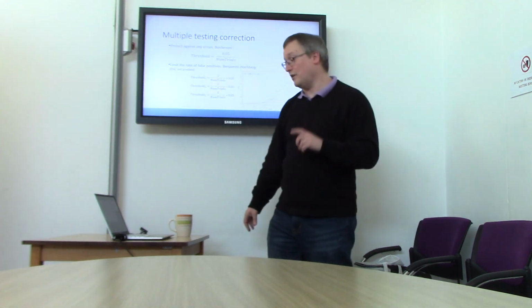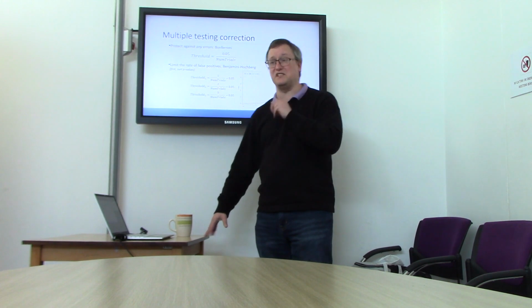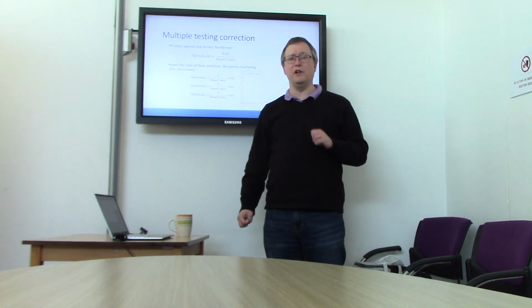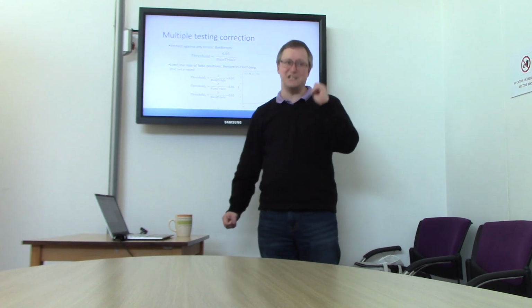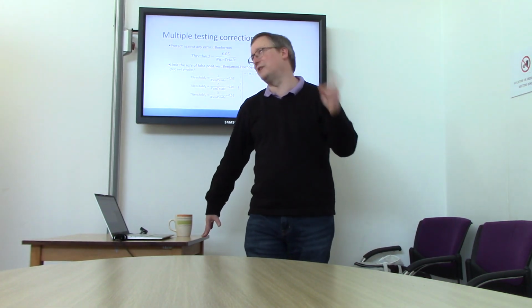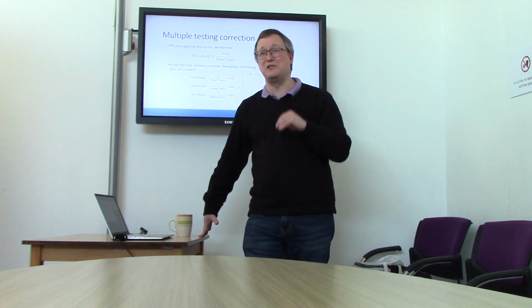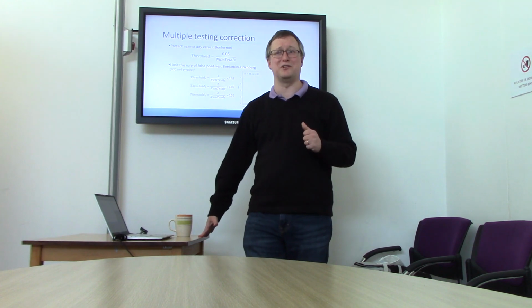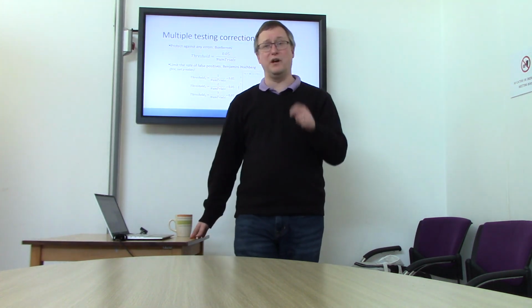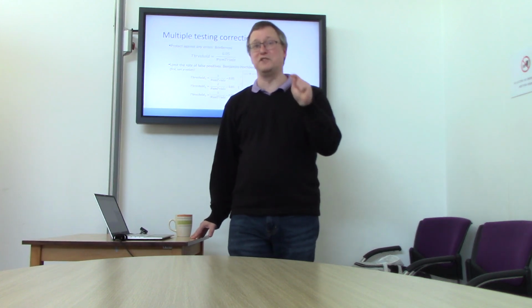Okay, so there are 2 primary ways that you see people using multiple testing correction. The first of these is the Bonferroni correction. Bonferroni correction is really, really tough correction. If you want to see all of your false hits go away, Bonferroni is great for this. But it's quite likely to kill the proteins you really thought were truly differential, because Bonferroni is extremely punitive. The role of Bonferroni is to protect you from making any false positive claims.